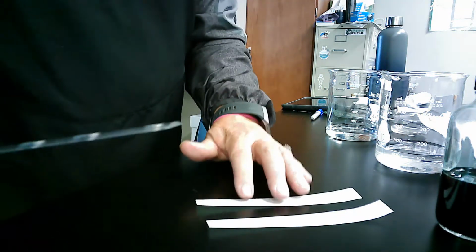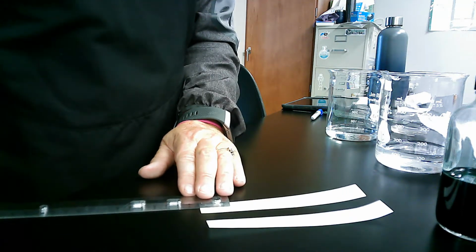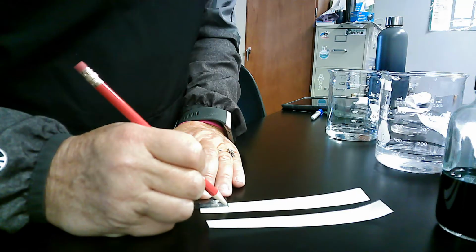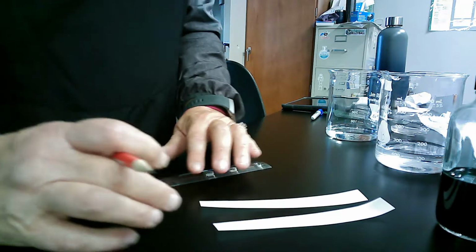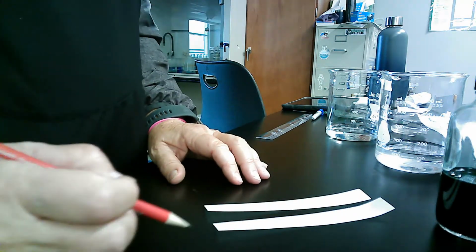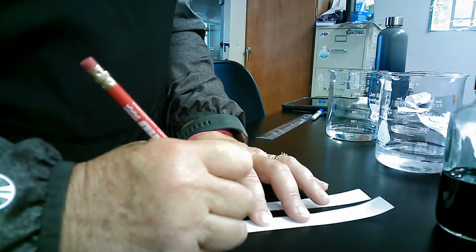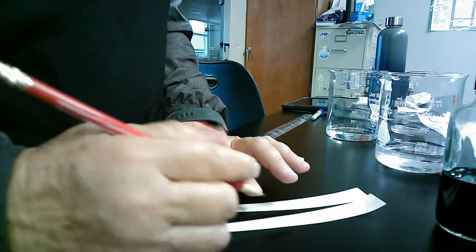I'm going to do the same thing on two of them to be fairly consistent, just to make it easier on myself. One of these is going to go into the sodium chloride and one is going to go into the isopropyl alcohol. Once I make a starting line, then I'm going to put a dot in the middle of each one. That pencil dot is where I'm going to put my ink.